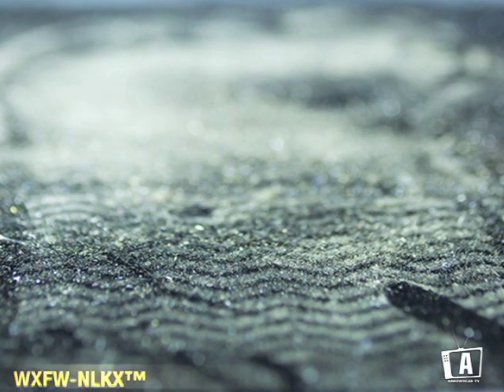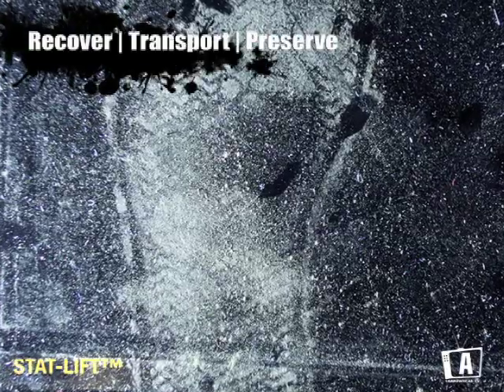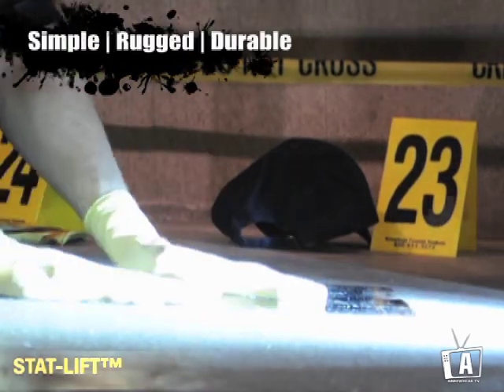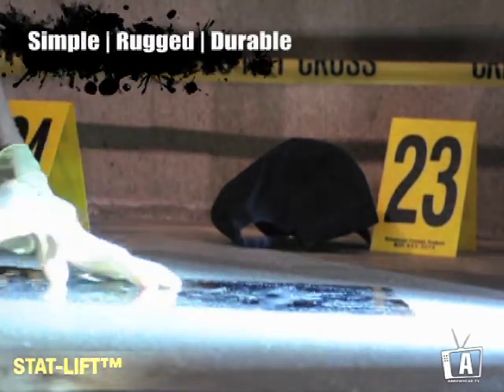Arrowhead Forensics is pleased to introduce StatLift, a revolutionary, cost-effective way to recover, transport, and preserve impressions. StatLift is simple to use and its rugged durability is matchless in the industry.